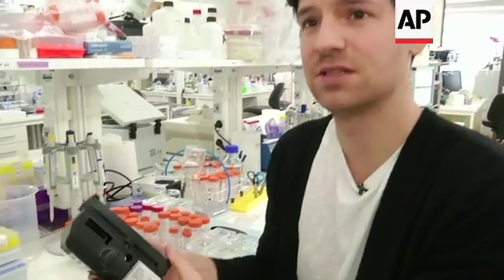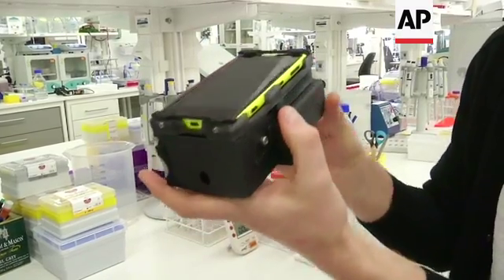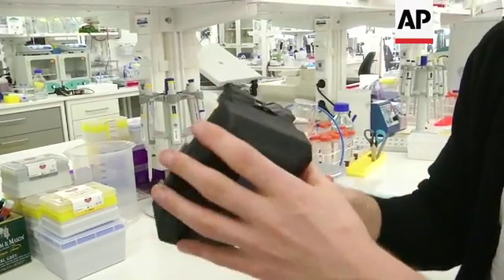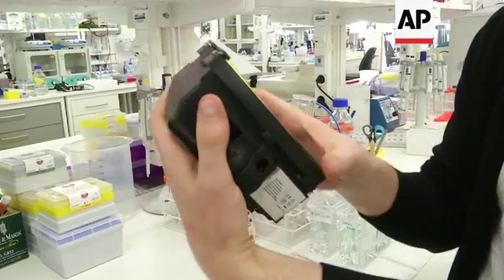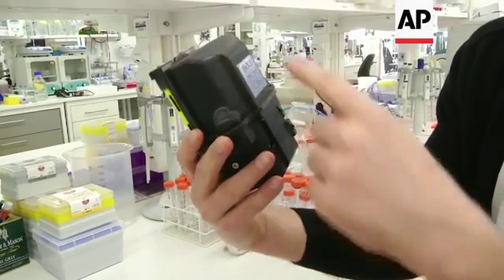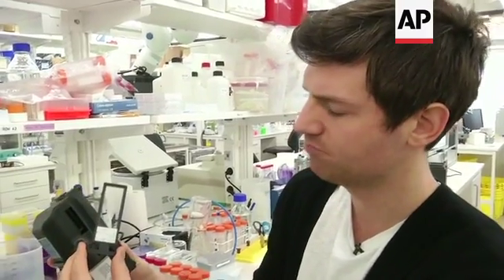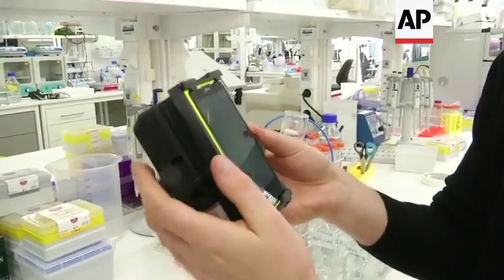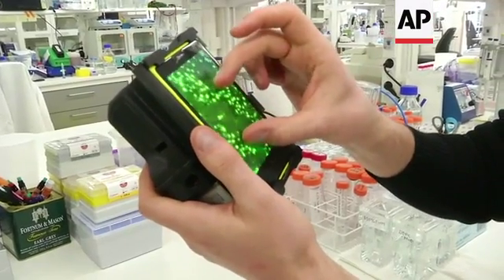This is the device, this is the setup, the 3D printed attachment that is sitting underneath the actual mobile phone here. You can imagine the camera of the mobile phone sits on that side. What you have in this attachment is actually two LED lights that sit facing the camera module. What you then do is insert a sample slide into the sample holder, and then you use the camera module of the phone to take images of your sample.